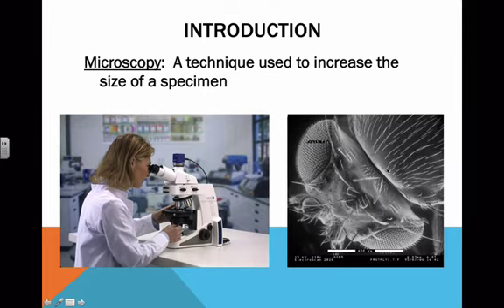You can see all of the bristles on the thorax, on the head here. You can see parts of the eye, and look, there are little bristle-like structures on the eye that you wouldn't even know were there if you didn't have microscopy or the use of a microscope.